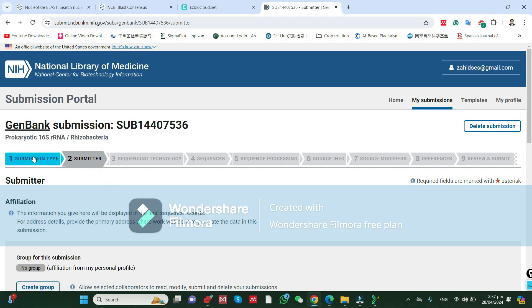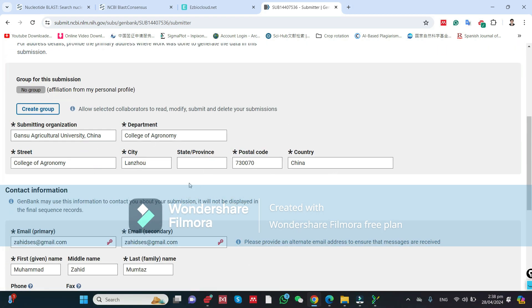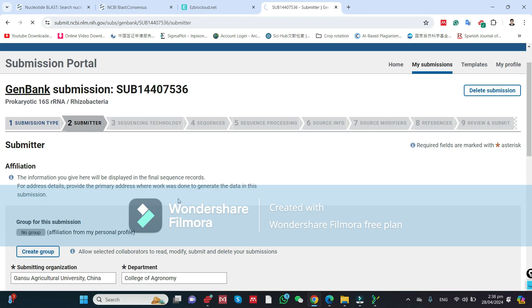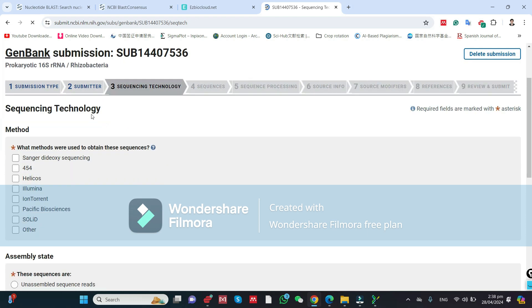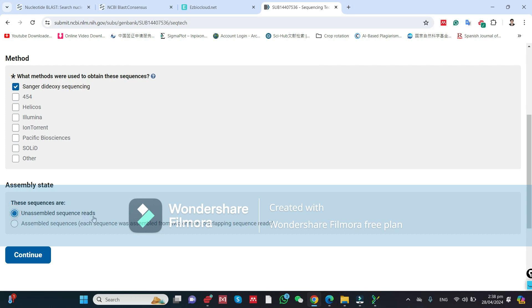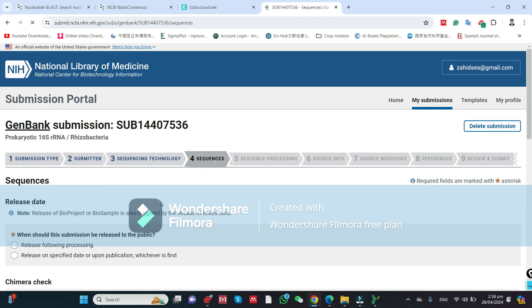Click Continue. There are nine steps that you need to complete. The first is the Submission Type, which I have already filled in. Next is the Submitter Name, which comes from your profile — you do not need to worry about that, just click Continue. Then it will ask about Sequence Technology. I have single-read Sanger sequencing, and I have one assembled consensus sequence because forward and reverse sequences have been trimmed and a consensus sequence has been prepared.